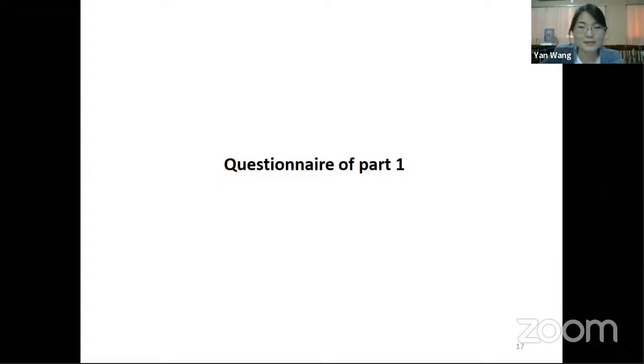Okay, I think maybe my question is designed a little difficult. So the first, what's the purpose of preparative HPLC? As we said, analytical HPLC is used to analyze the sample, right? For preparative HPLC, we use it to purify the sample. So it's used for purification of compounds.